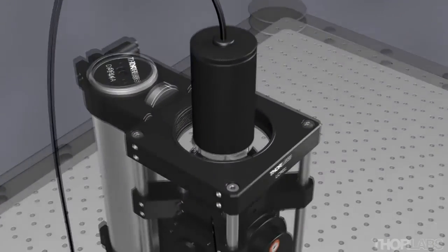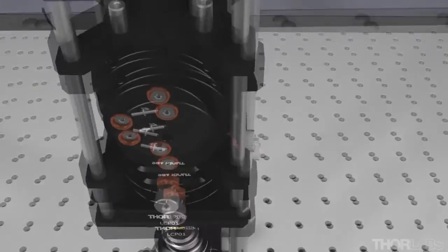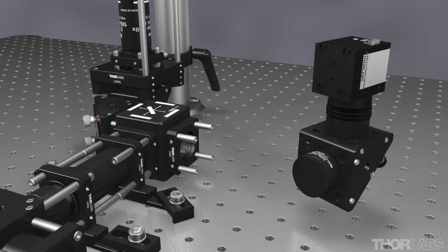Install the white light source on the top of the vertical module. The camera module mounts onto the filter cube face opposite of the beam expander's output, as demonstrated here. Slide the camera onto the ER rods and secure with the set screws.